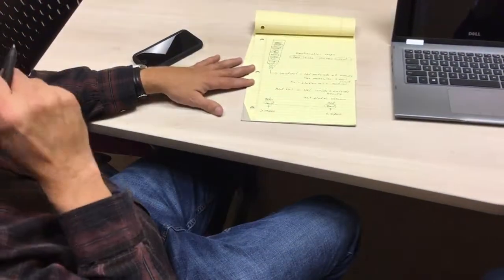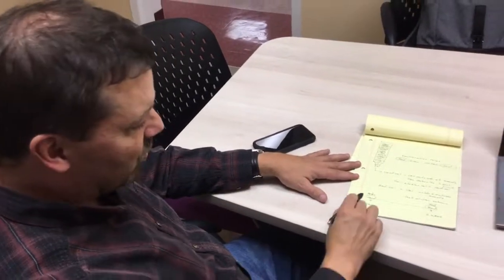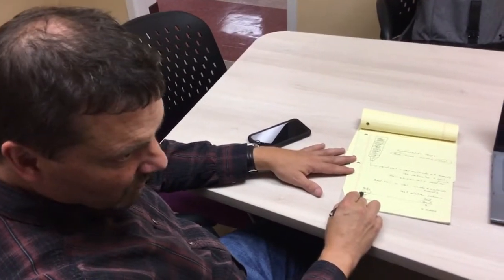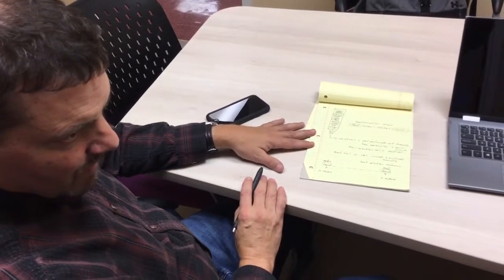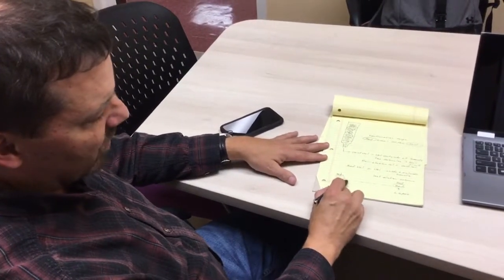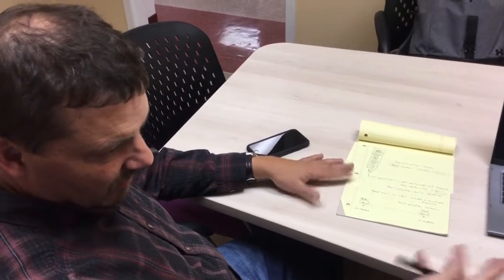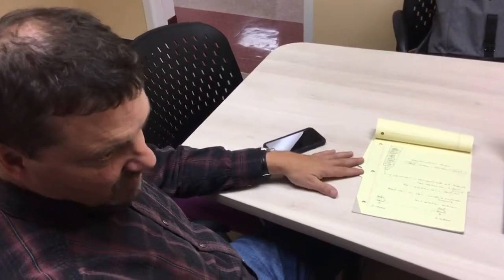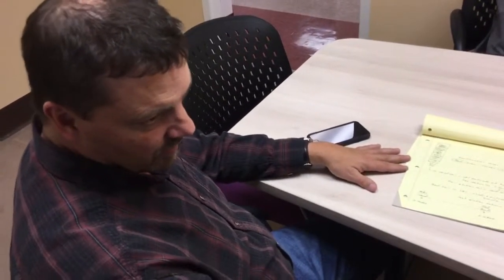So we had to ask ourselves, did the beta-galactosidase come out with the blue, or after the blue? It came out a little bit after the blue. The way we knew where it was is we did an assay for it. We added the substrate, the ONPG, and saw where the yellow color appeared.